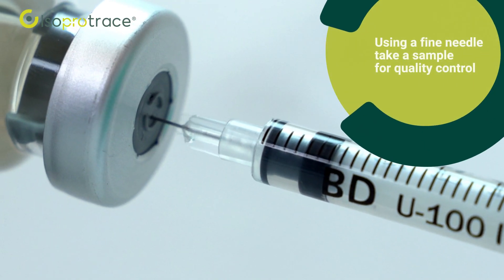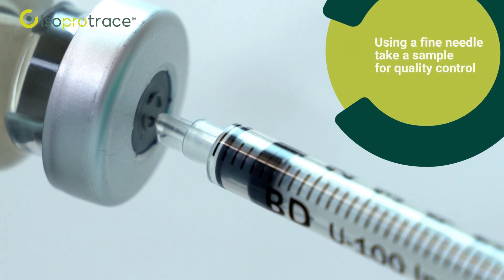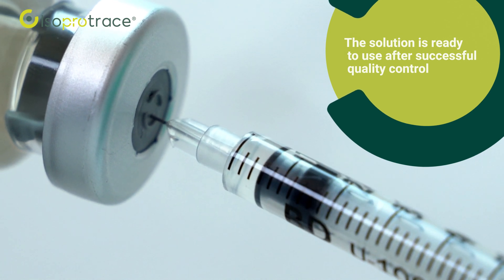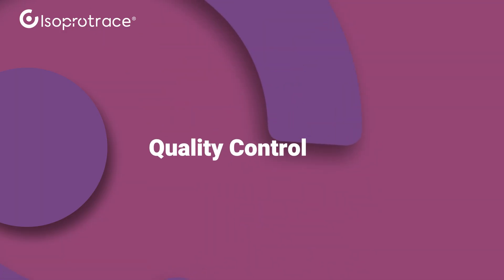Using a fine needle, take a sample for quality control. The solution is ready to use after successful quality control. The quality control procedure is simple and easy to apply.